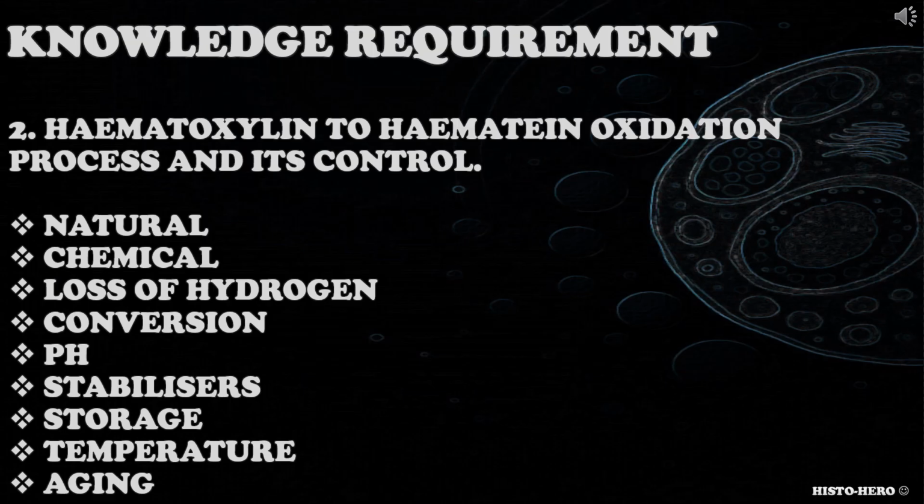I think there might be a misspelling in the portfolio as it states hematin not hematein. I believe it should be hematein not hematin, as hematein is oxidized hematoxylin, whereas hematin is a brown pigment formed by decomposition of hemoglobin.